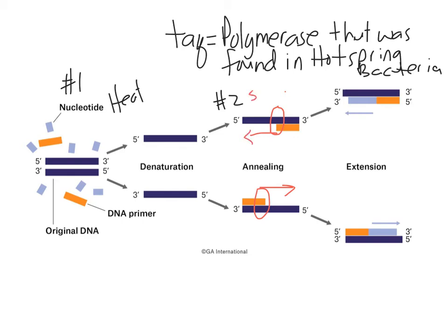Now we're still at about 50 degrees Celsius. So our body's DNA and our DNA polymerase and our primers and everything would all denature at 50 degrees Celsius. But what makes PCR possible is that we've got the DNA polymerase called Taq polymerase, out of these bacteria, and we're utilizing their ability to survive in a very hot climate. And so the polymerase runs, and then boom, by step 3, you have 2 identical copies of the original DNA strand. Okay, so you ran that one time.